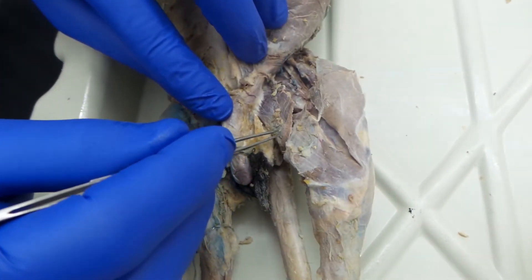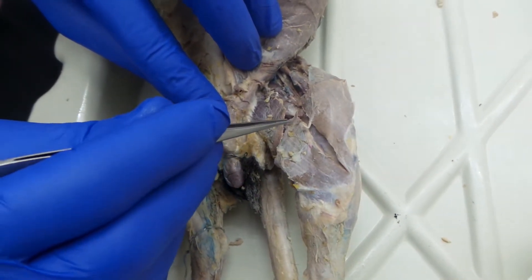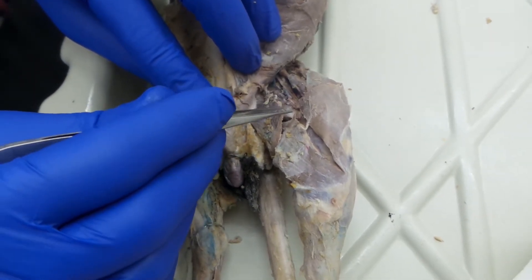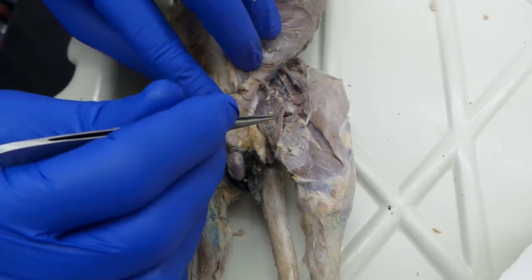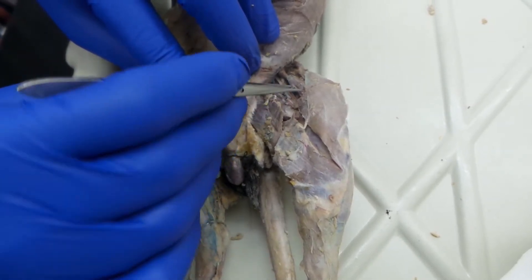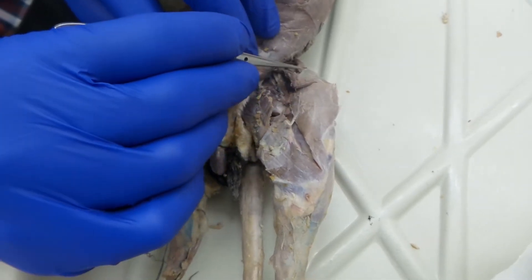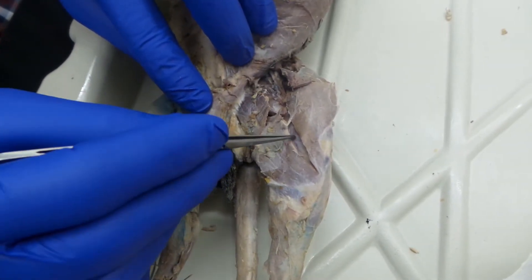This is exam 2, day 2. We're going to look at muscles of the upper leg. Starting on the medial side, inferior side, we're going to see first the sartorius and the gracilis.